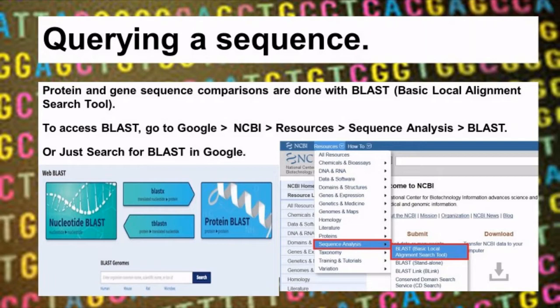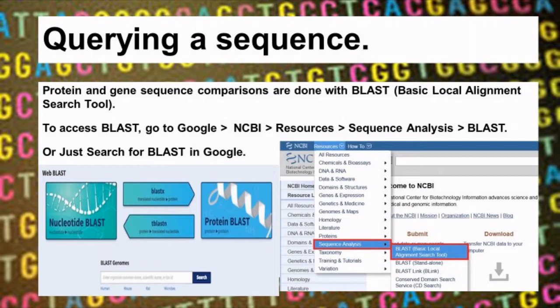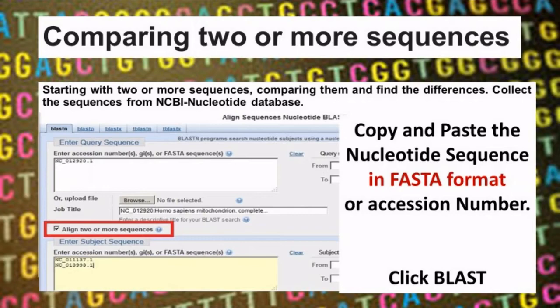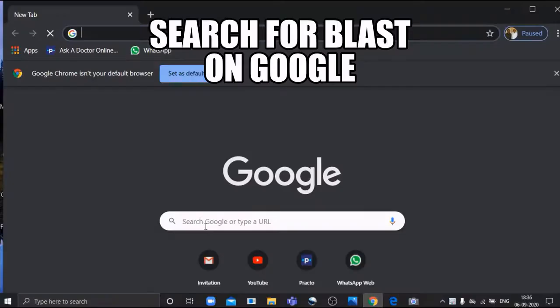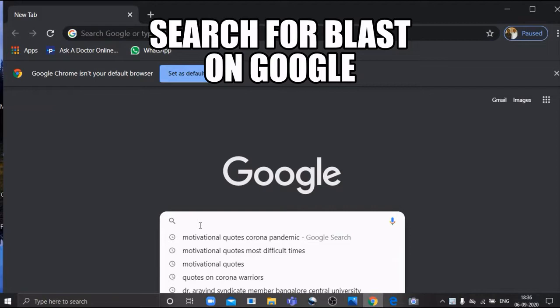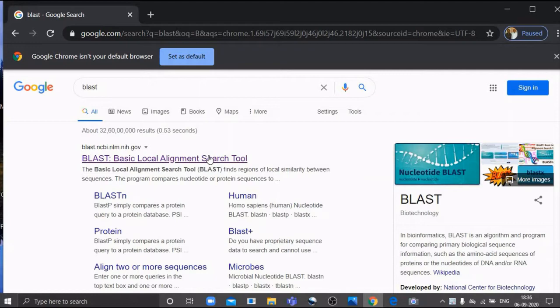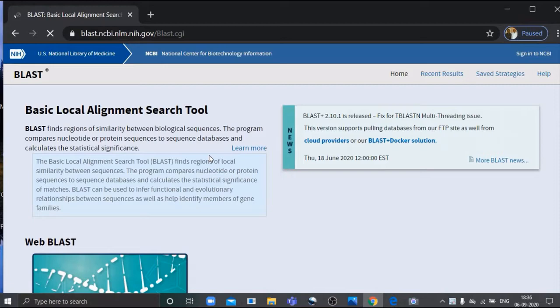This is how you query a sequence using the BLAST tool. You need to access the BLAST tool available on the internet, and you require the sequence in FASTA format — whether it is a protein or nucleotide sequence. To find the tool, go to Google and search for BLAST, and you will find it available on the NCBI homepage.